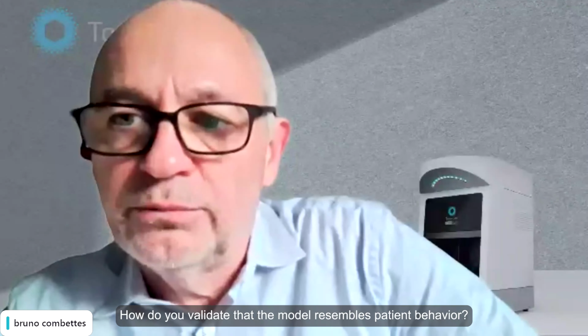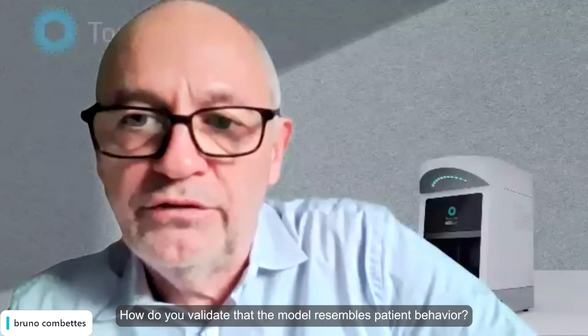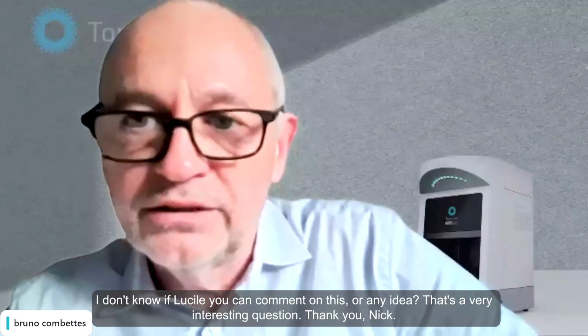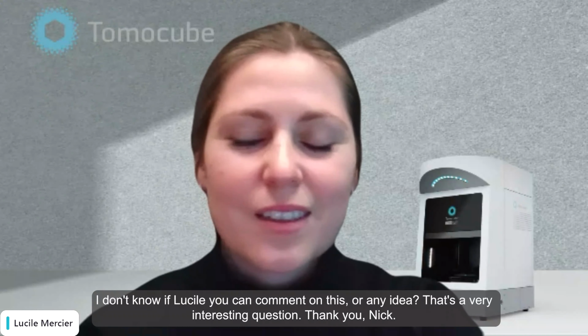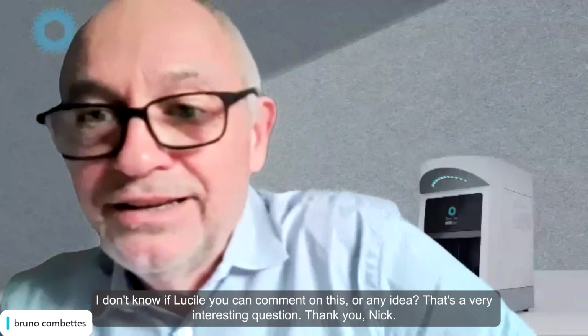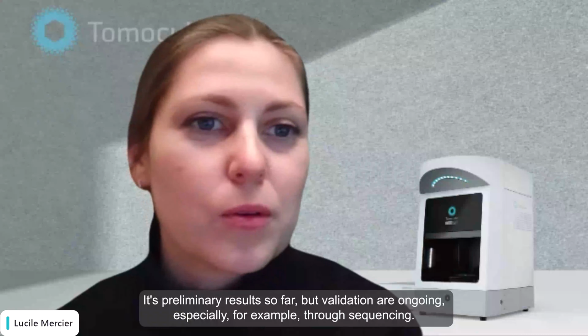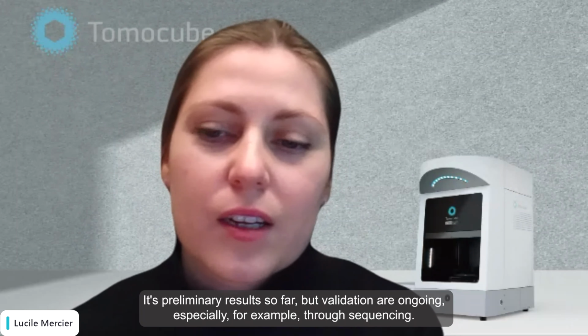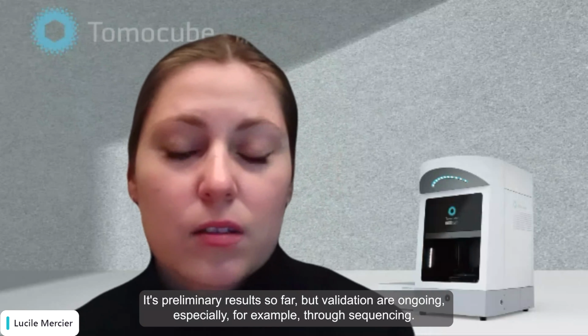And how do you validate that the model resembles patient behavior closely enough? So I don't know if Lucile, you can comment on this. That is a very interesting question. Thank you, Yannick. It's preliminary results so far, but validations are ongoing, especially, for example, through sequencing.